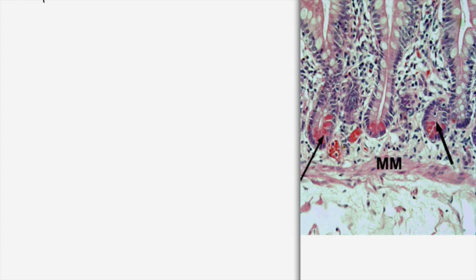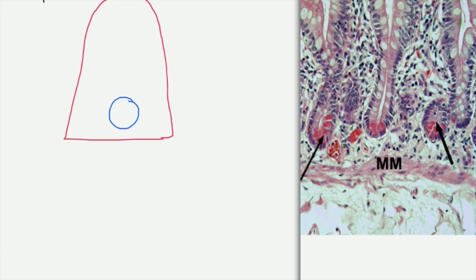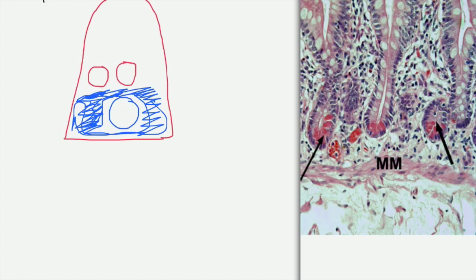As regards the light microscopic picture, it has a very characteristic picture: it is a columnar cell, and it has a basal rounded nucleus, and it has a basal basophilic cytoplasm. And at the apex we have acidophilic secretory granules, which contain the secretion produced by this cell.